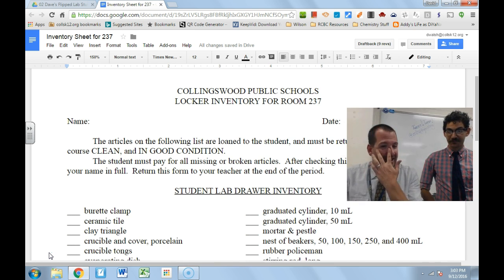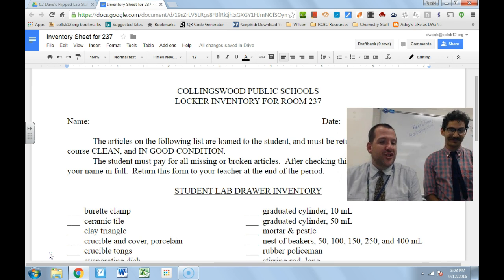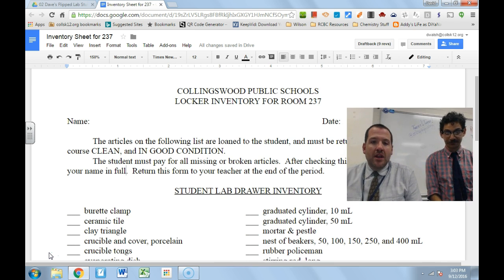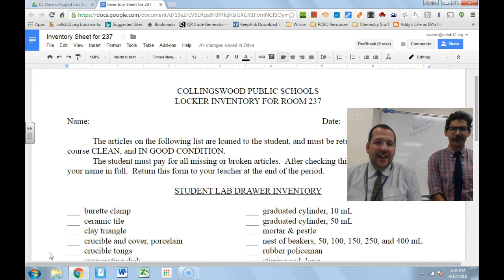On the screen you'll notice there's the check-in sheet that has the names of all of the pieces of glassware. You will see those things during lab. So we'll take a minute and not only tell you what they are and show them to you, but then tell you what they are used for. So there are three major categories of glassware.